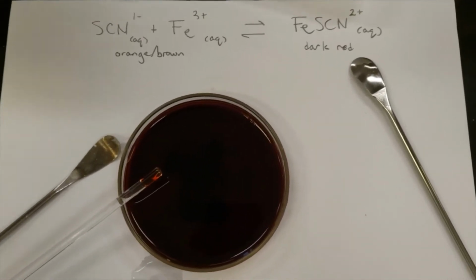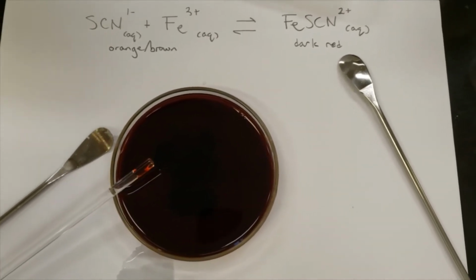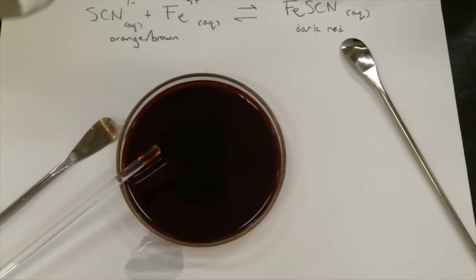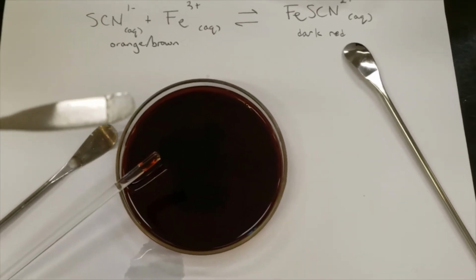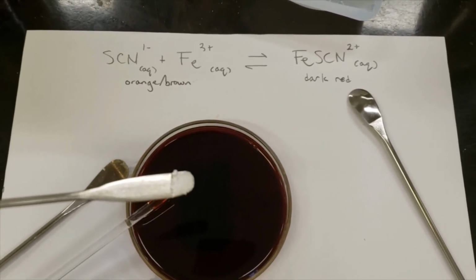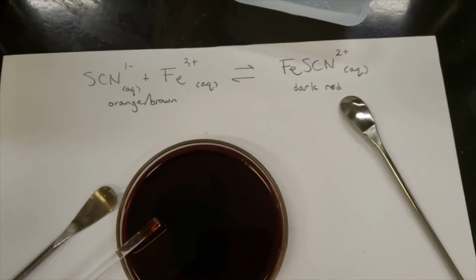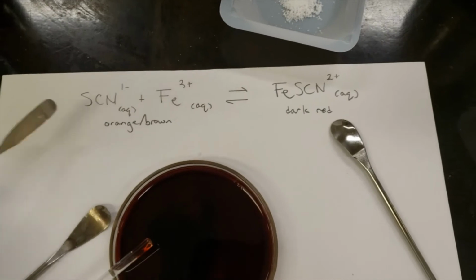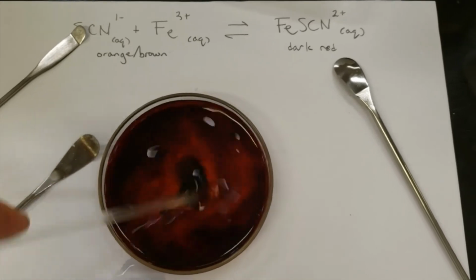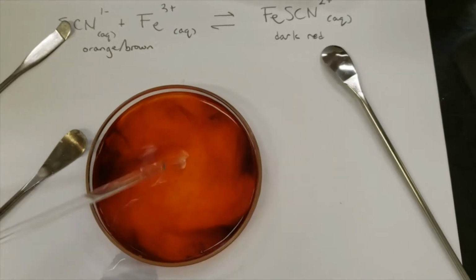The first thing I'm going to do is add a small amount of a chemical called sodium phosphate monobasic. And this chemical is going to pull some of the iron ions out of solution. So if you look at the equation, by adding this chemical, I'm going to be reducing the concentration of the iron 3 ions. I'm going to do this step by step, because if I add too much too quickly, it'll get too light. So you can see immediately that the solution has become lighter.